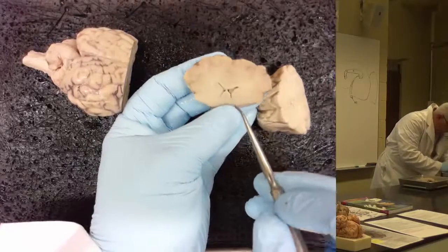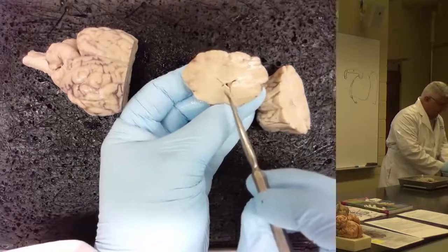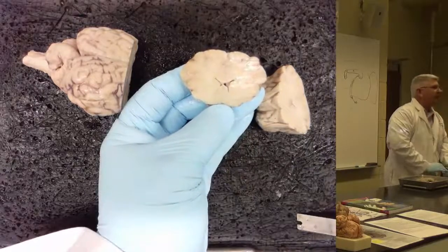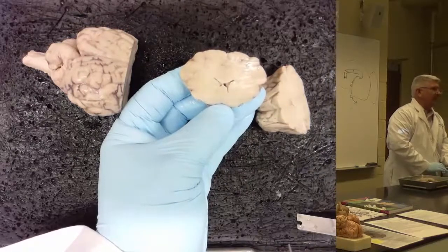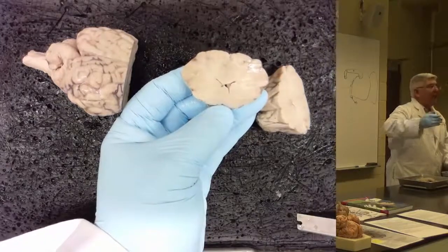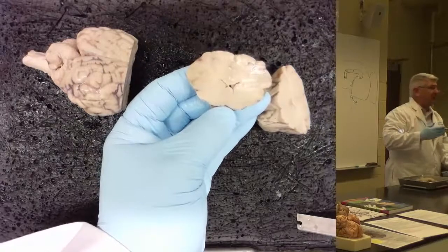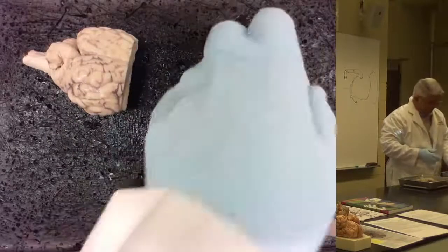This is kind of actually moving further back. So now the fornix is not really a U, it's kind of a big structure there. So this is not a slice that I would actually use. I'm either going to use a slice that's clearly anterior or clearly posterior, but not in the middle, because I'm not trying to trick you guys, and it gets harder to see this. So I probably wouldn't use that slice.